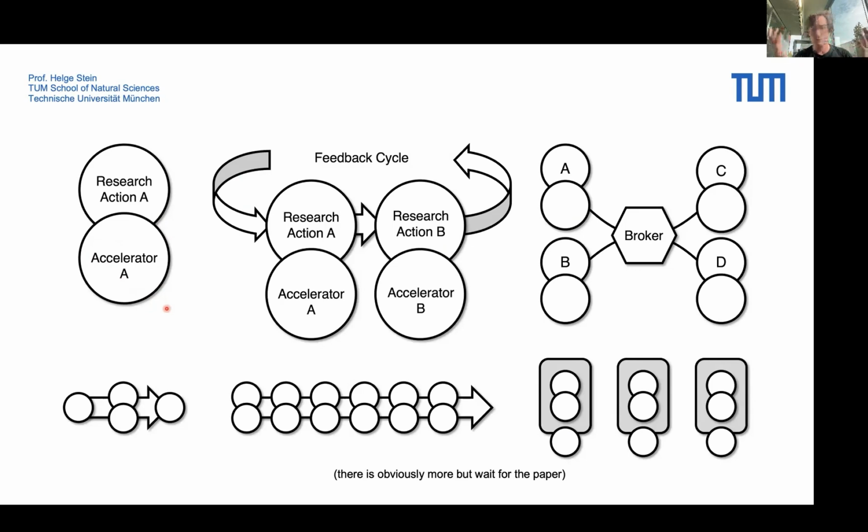For instance, if you do a characterization that is automated, and you feed that back to the synthesis, and you want to just optimize the composition of some alloy, you can be in this kind of research mode where you integrate them and you have this feedback cycle. However, it becomes very complicated if you need to work with a lot of research partners, especially in different countries, or even working in entirely different domains.